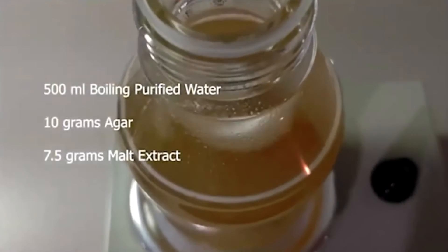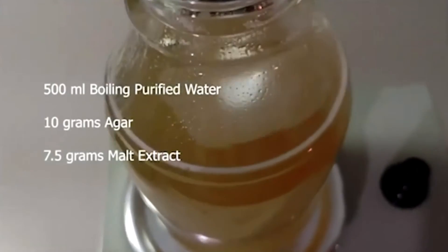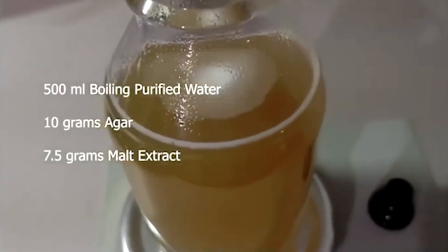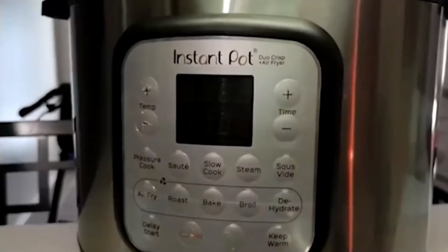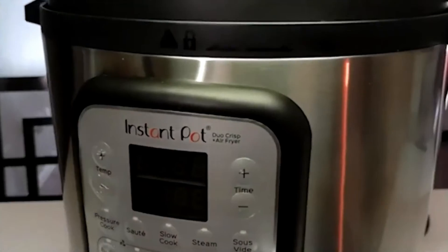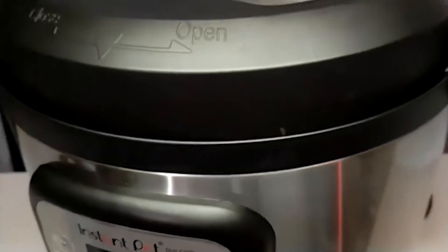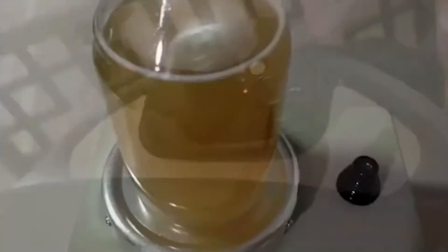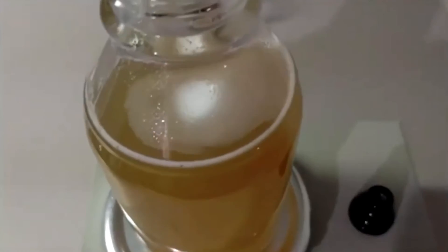Using 500 milliliters of boiling purified or distilled water, mix 10 grams of agar and 7.5 grams of malt extract. Pressure cook for no longer than 20 minutes at 15 psi so you don't caramelize the sugars or overcook the nutrients. Allow the MEA to cool between 120 and 140 degrees, then you're ready to pour.